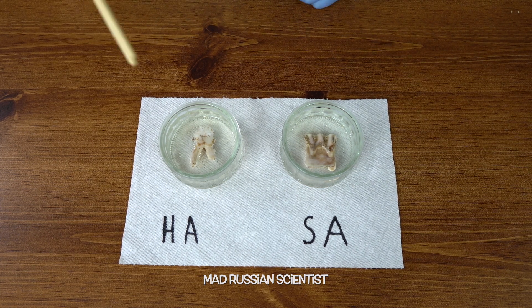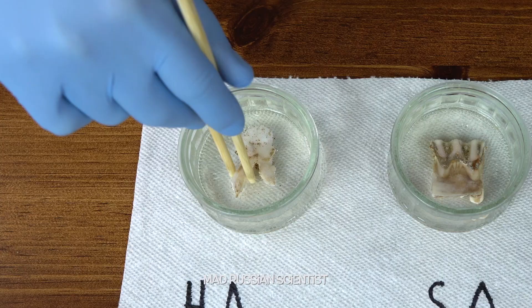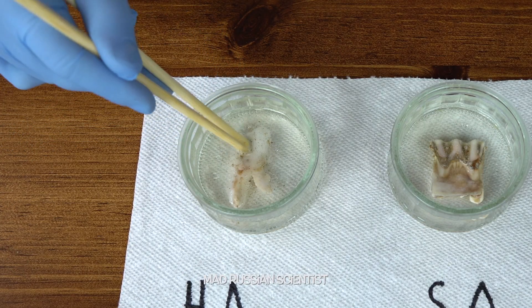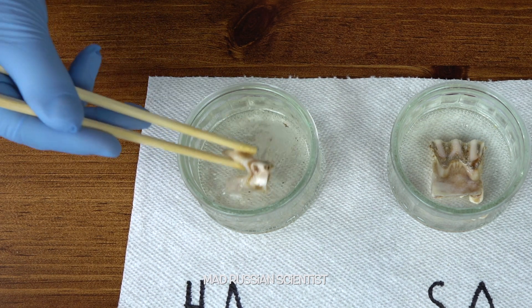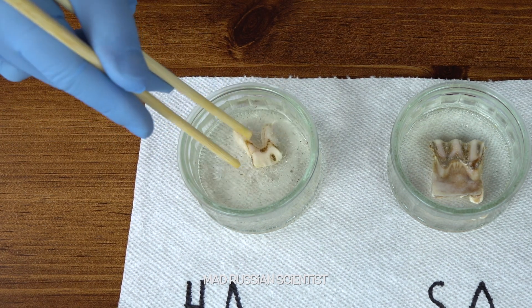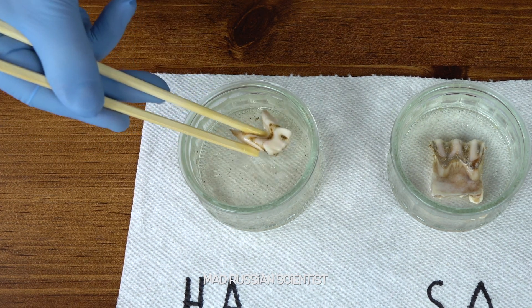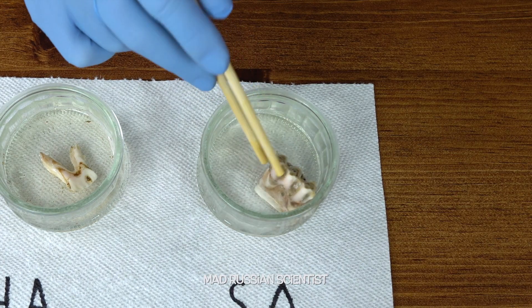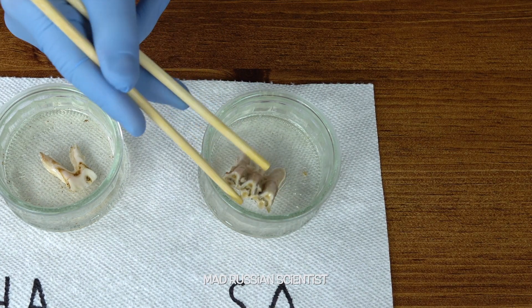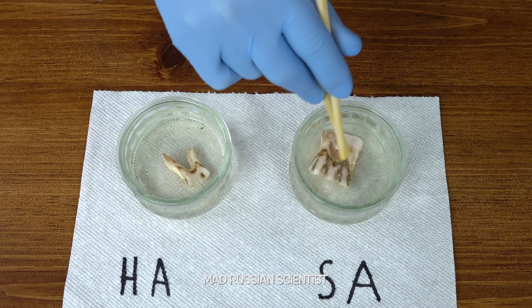Alright, let's see what we have here. The hydrochloric acid is here and sulfuric acid is here. Oh, check this out — it's foamy right here! And look at this tooth, it actually got cleaned pretty well. Crazy, huh?